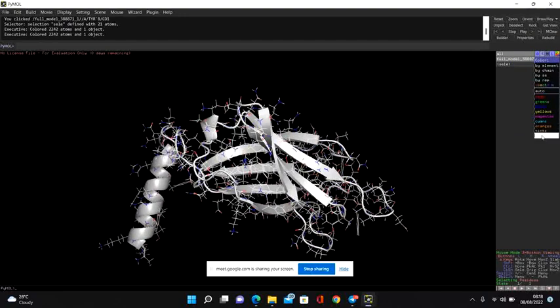But these are actually required, because suppose you want to upload a picture to your thesis and all, then of course you need good representations. This particular color coding allows you to give a good representation. Sometimes there are two molecules. Suppose you are seeing a docked structure. When I'm seeing a docked structure, then obviously coloring two different proteins in a different manner ensures that you can understand which two proteins those are. So like that you can understand and see the structures.